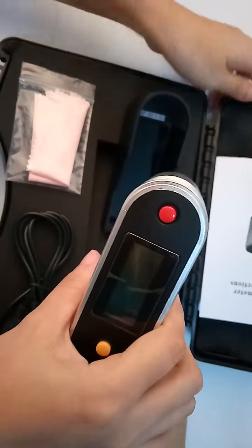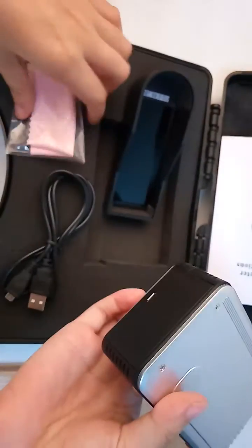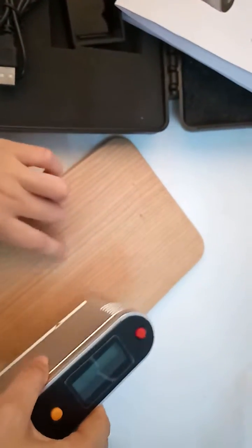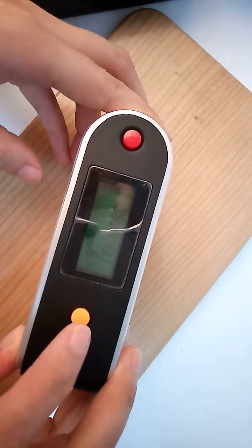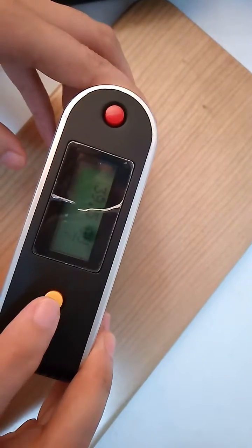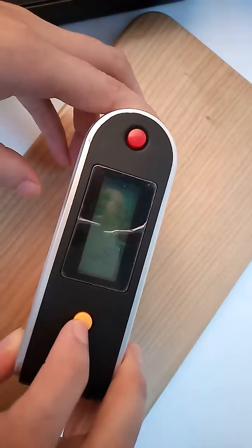Use a USB cable to transmit data. See the user manual. Now we can test the sample — this sample is wood furniture. Readings: 13, 9.5, 39.5, 37.1, 0.3. Nine times total.